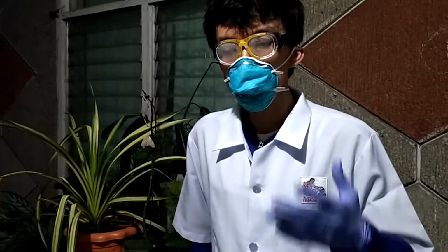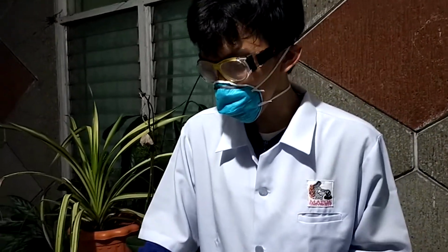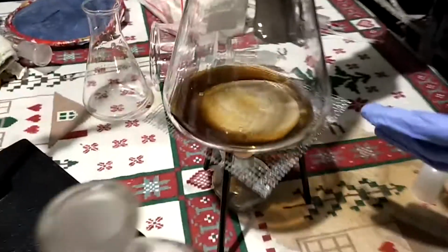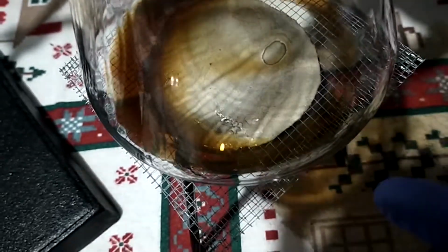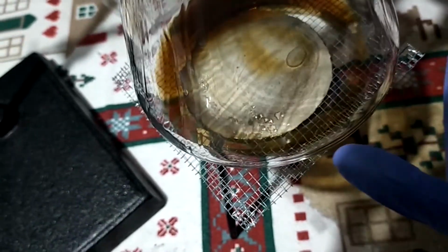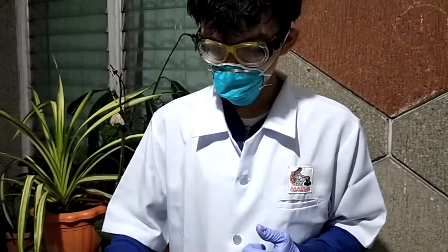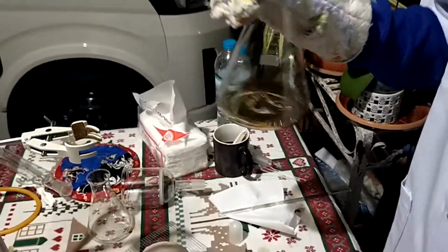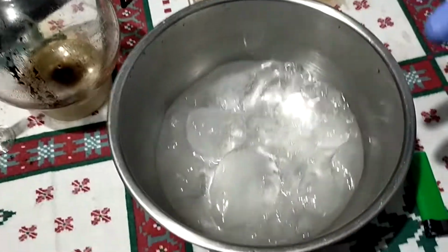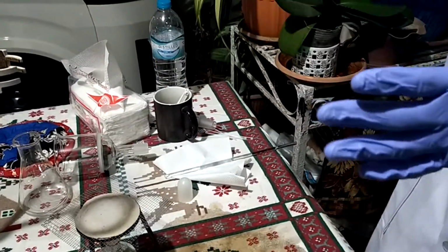Okay, so initial trials for crystallization yielded no significant effects. So I tried to heat again the solution, and as you can see, there are some crystallized parts here, though they may not be of significant weight, but they do exist. You just gotta wait until it heats some more. So we had heated this, so there's only little remaining of the solvent left. So now we're going to treat this in an ice bath. But maybe later we're going to let it cool for a bit so as not to thermally stress the flask.